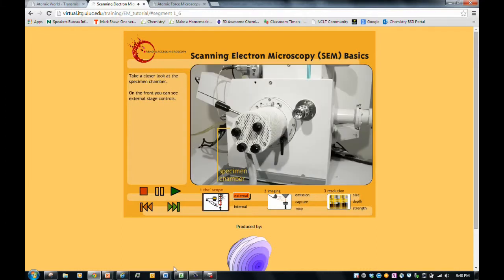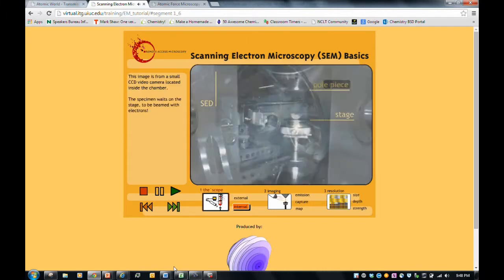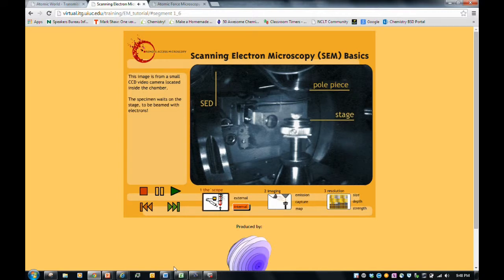The sample is placed inside the sealed chamber of the electron microscope, which must be pumped to a relatively good vacuum before we can turn our primary electron beam on. Air molecules anywhere inside the electron microscope could be collided with, sending the electrons far off course. Collisions with air molecules are unacceptable when trying to maintain reliable image sharpness and minimize noise each time the microscope is used. This image is of the inside of the electron microscope.